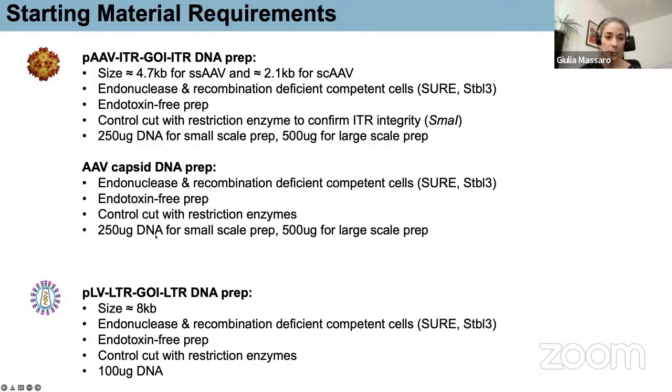The same goes for the AAV capsid, and if we're talking about lentivirus, for the gene of interest lentiviral plasmid.